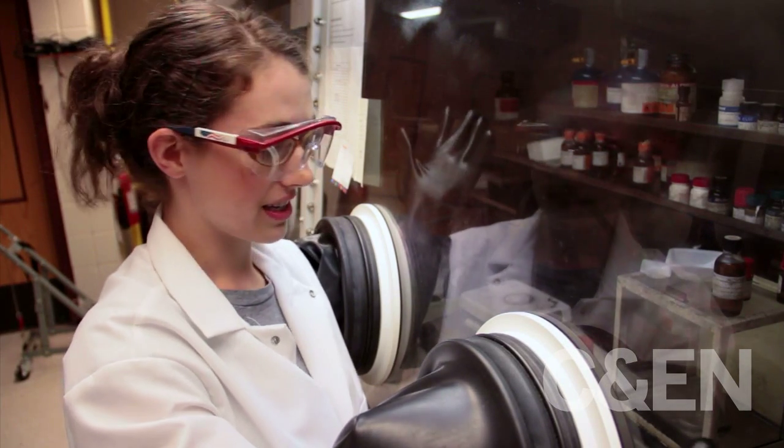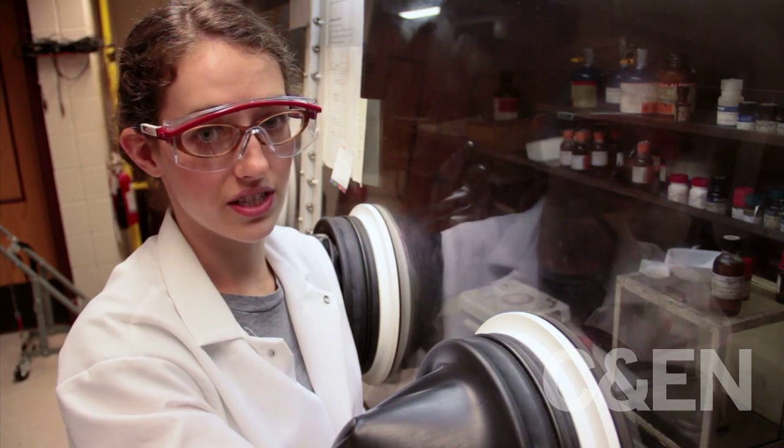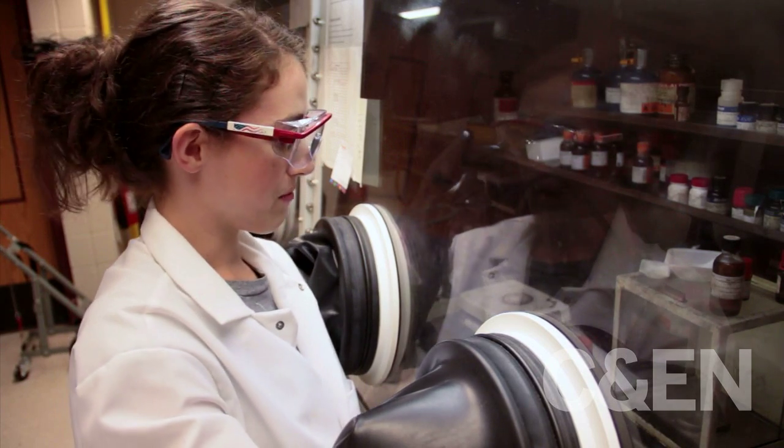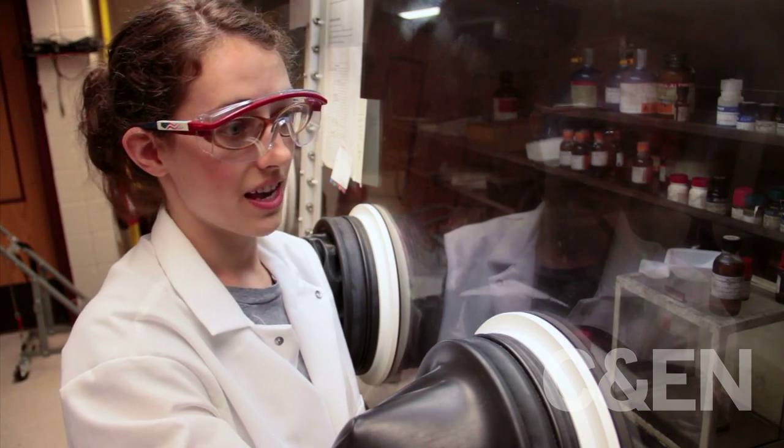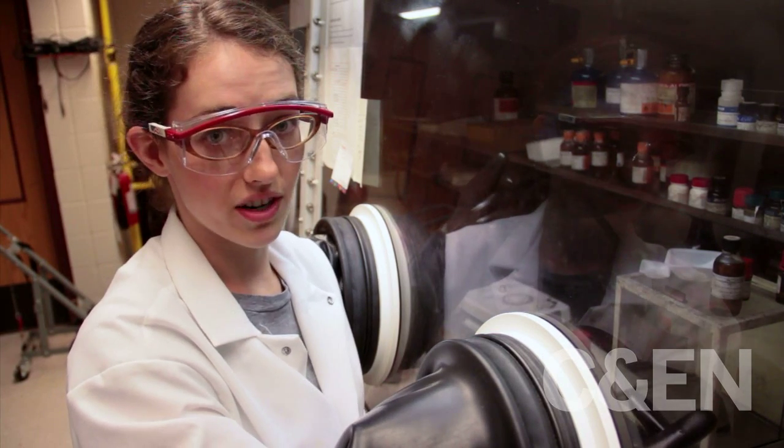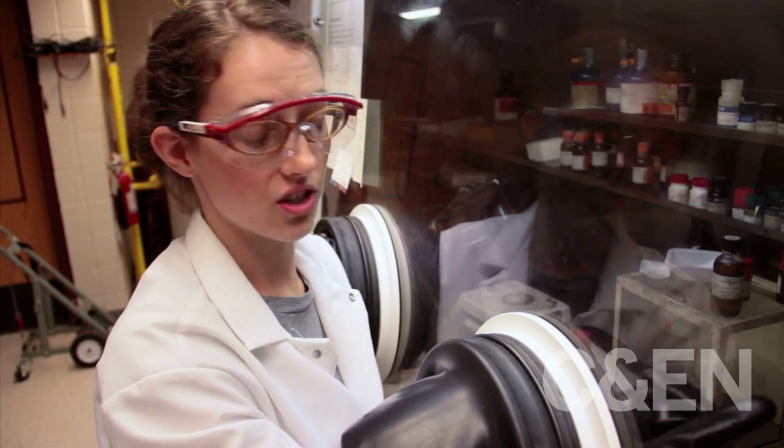I'm getting two things in here. The first is selenium, which is in powder form, and I'm going to dissolve that in tri-butyl phosphine. Then I'm going to split it between two syringes and head back over to do the injection.